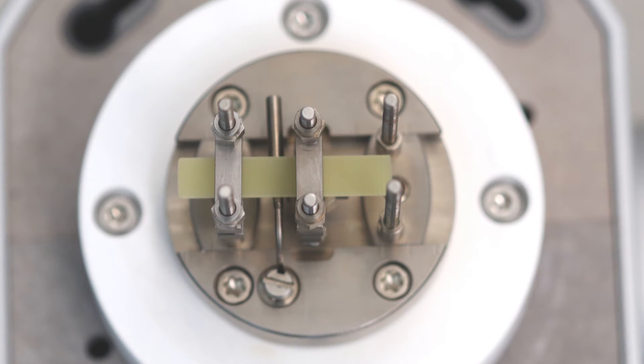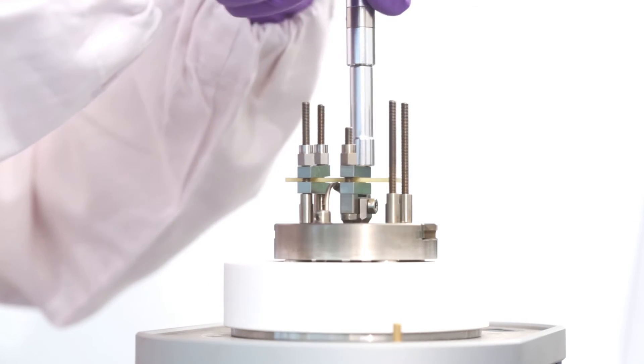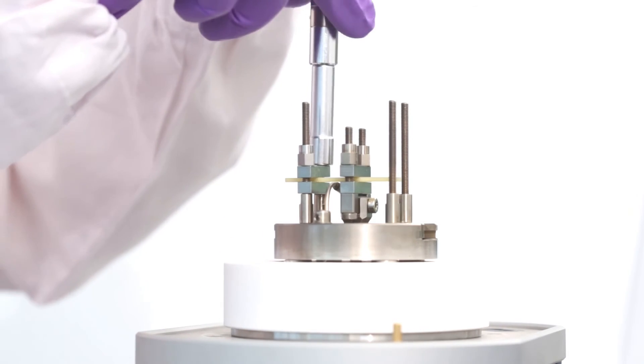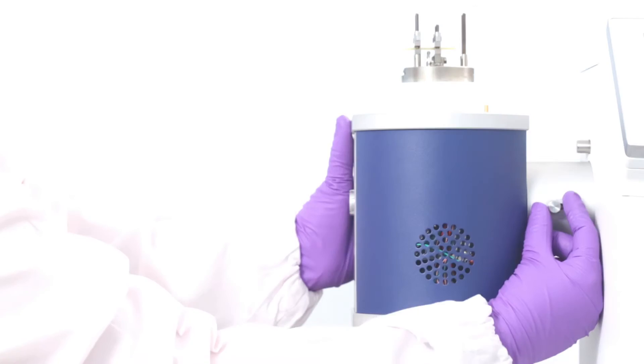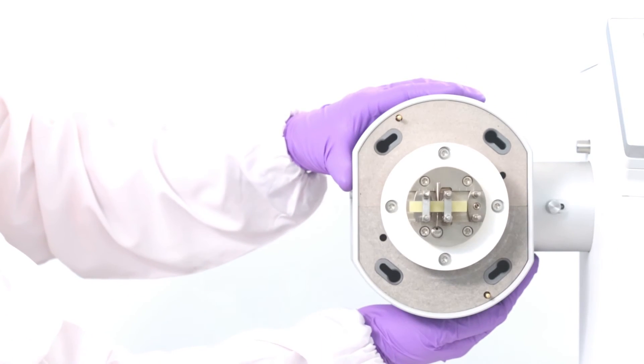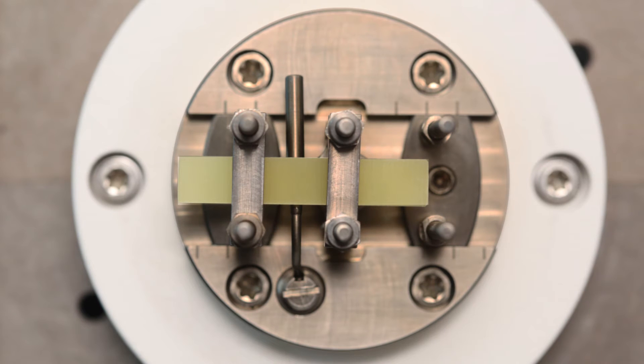After checking that the sample has not moved, we can proceed to tighten the outer two nuts and the middle two nuts evenly with a torque wrench. The measuring head must be rotated to the horizontal position. The sample is now ready for a measurement in single cantilever mode.